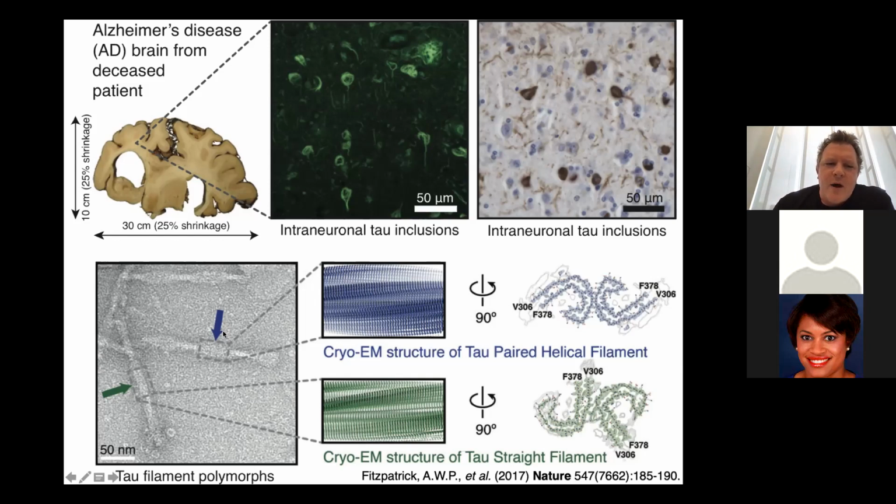And when we purify them out, you'll notice that there are two types of filaments shown here in blue and green. And the sample is not particularly clean. You can also see some other junk here, like this is apoferritin. There's some other molecules around. But the power of Cryo-EM is that we can take different views of just these filaments and actually solve their three-dimensional structure, cut through that density map, and actually find the underlying sequence underneath. So we can actually build into the density map the native structure of the protein forming these toxic protein aggregates.